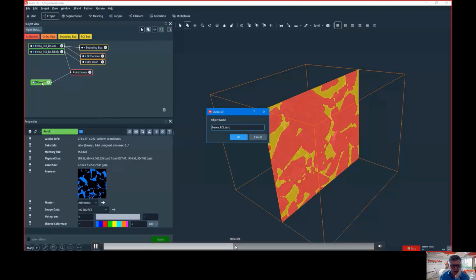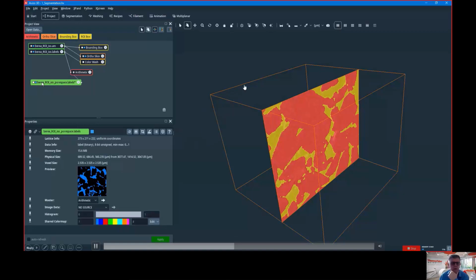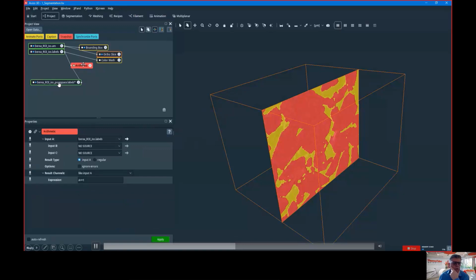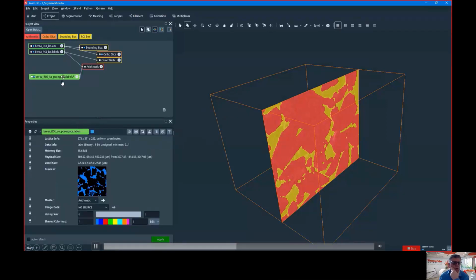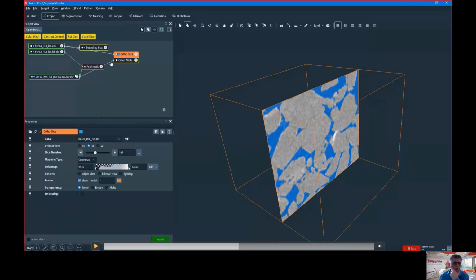Yeah, so I'll speed up a little bit. I think in 10 minutes or so, I would like to finish this one. So now I have only my pore space. You see, I reorganize things around a little bit, and I always put meaningful names on objects myself, because this is a simple one, but you see the trick.